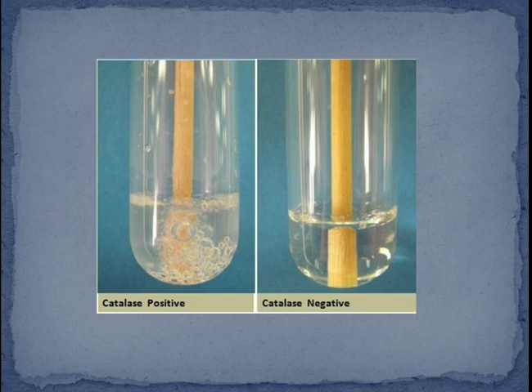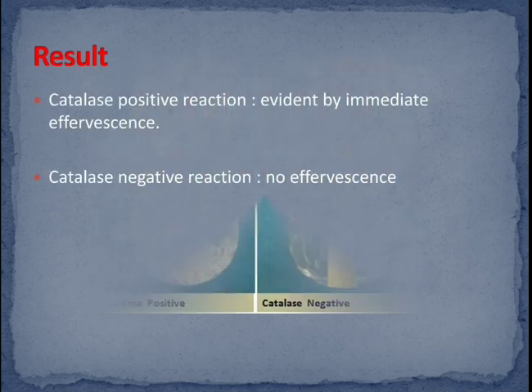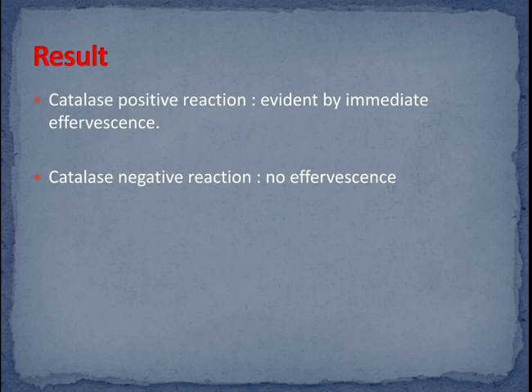In this figure, catalase positive tube contains a bubble at the end of the wooden stick. In catalase negative, no bubble formation. Result: catalase positive reaction is evident by immediate effervescence, that means bubble formation. Catalase negative reaction, no effervescence.